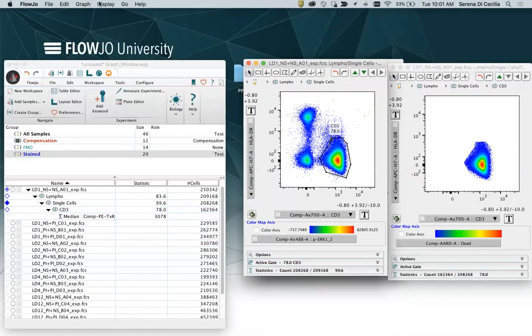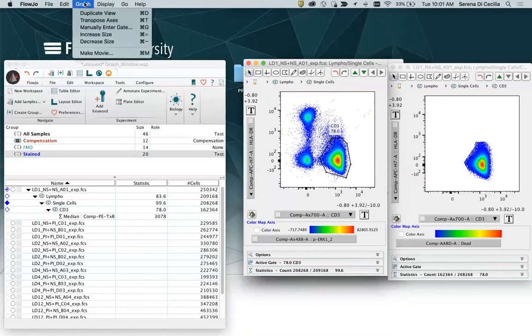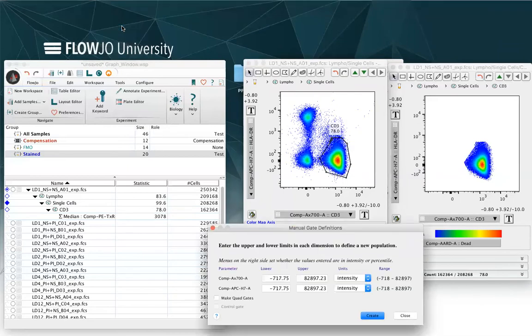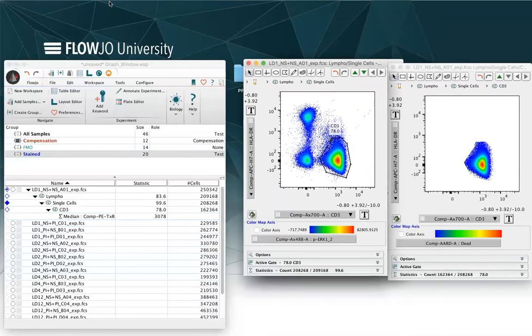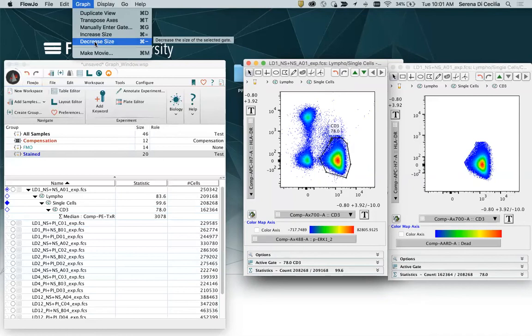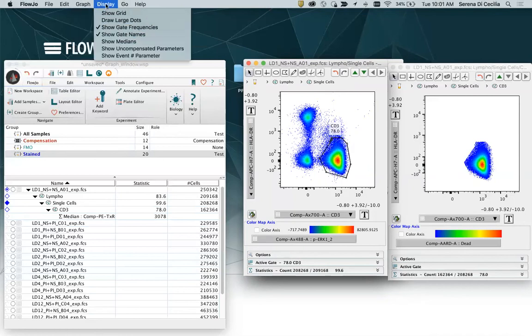If you go on your top bar and click on graph, you can select several options as duplicate view, transpose axis, or you can manually enter a gate, for example, by entering the upper and lower limits in each dimension to define a new population. You can also increase or decrease the size of the gate.